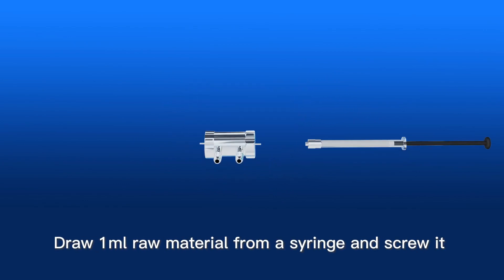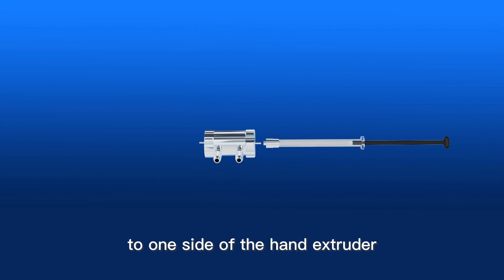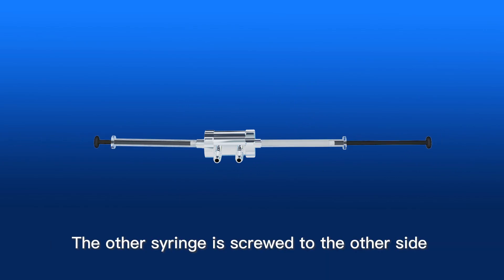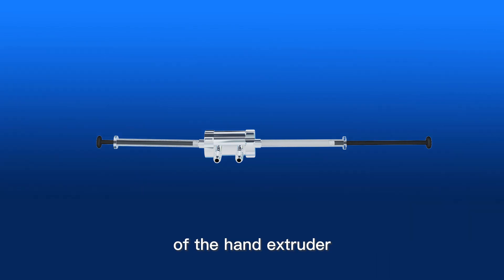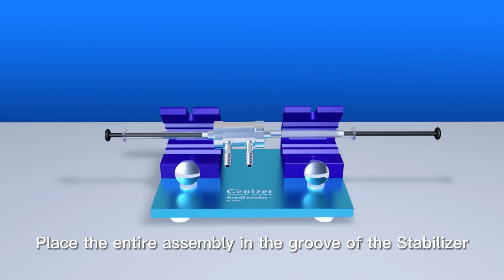Draw 1 milliliter raw material from a syringe and screw it to one side of the hand extruder. The other syringe is screwed to the other side of the hand extruder. Place the entire assembly in the groove of the stabilizer.